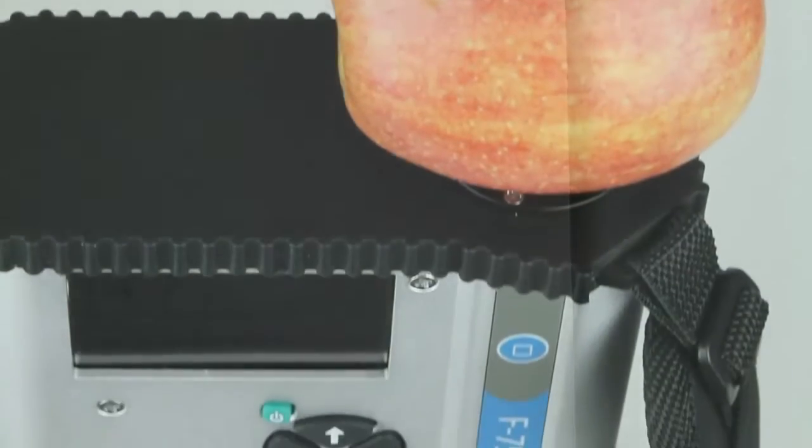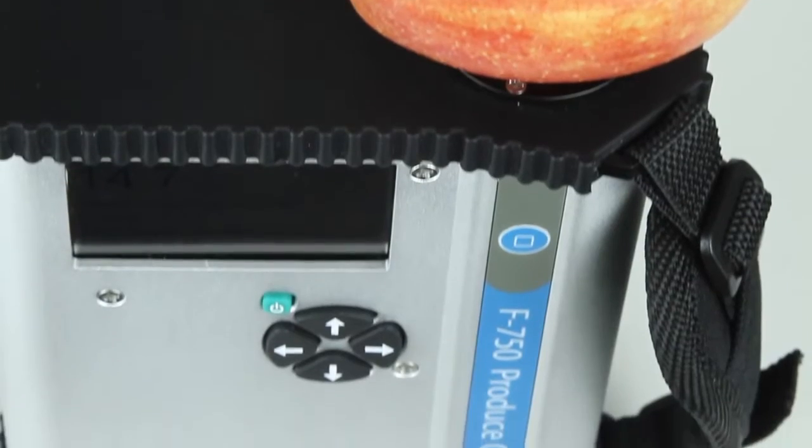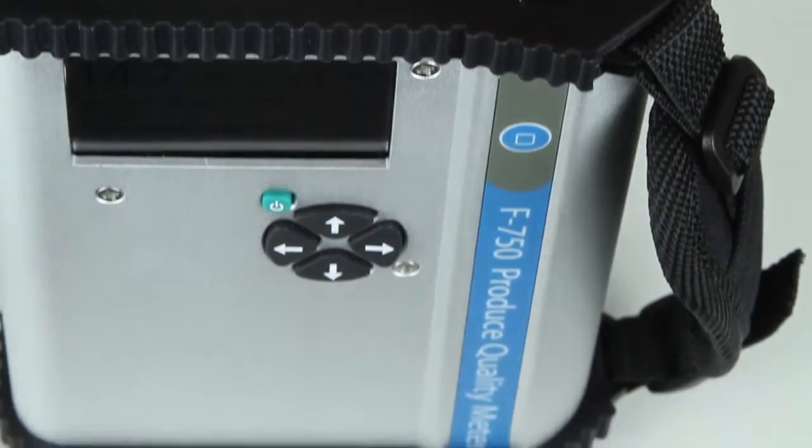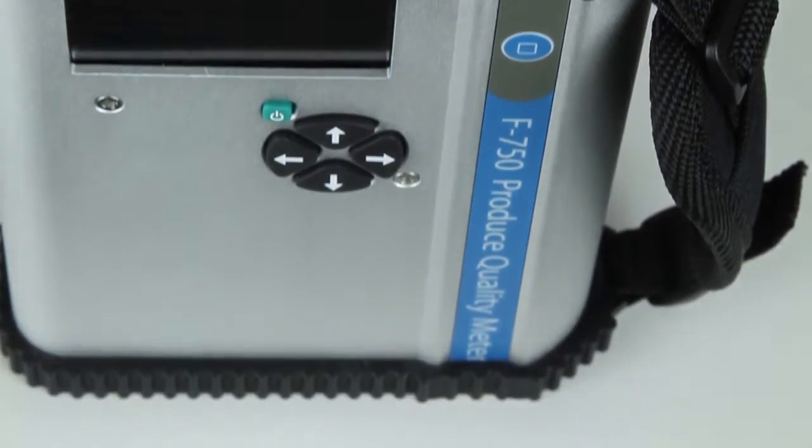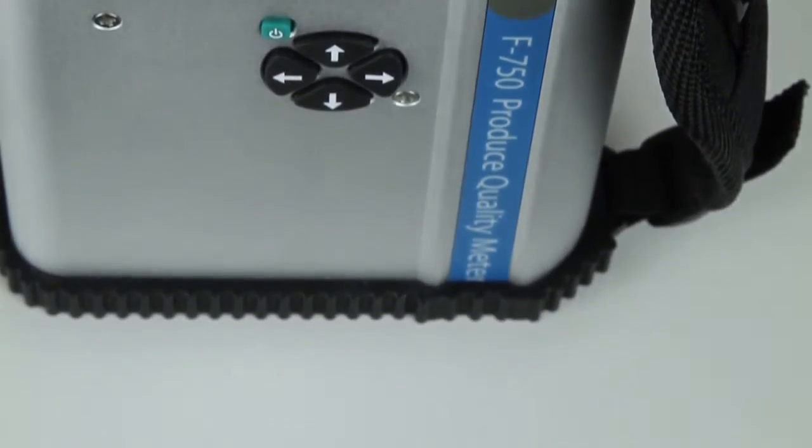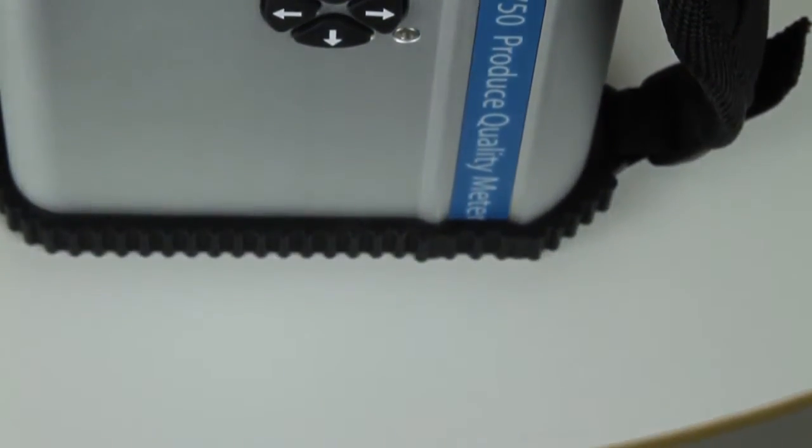Weighing in at only 1.05 kilograms, the F750 portably aids agricultural suppliers in developing fruit maturity and sweetness management processes for the benefits of growers, processors, and consumers.